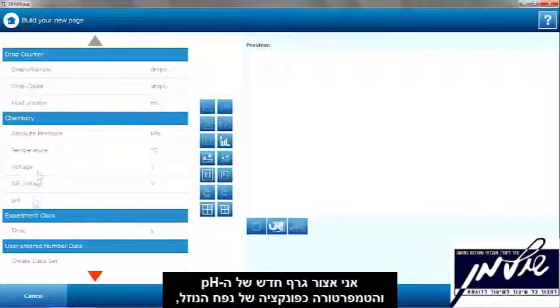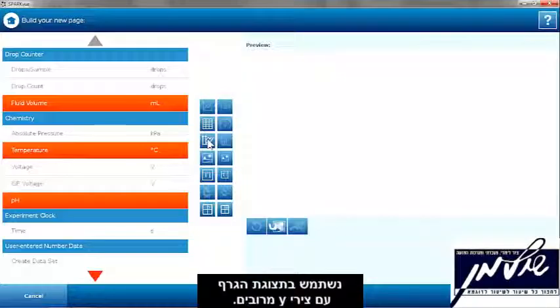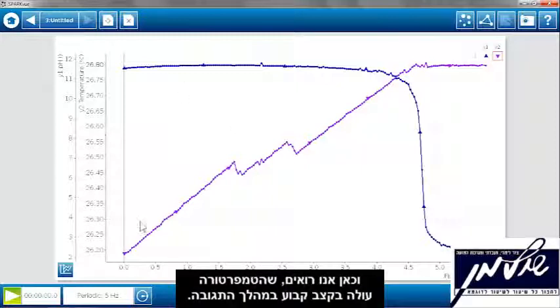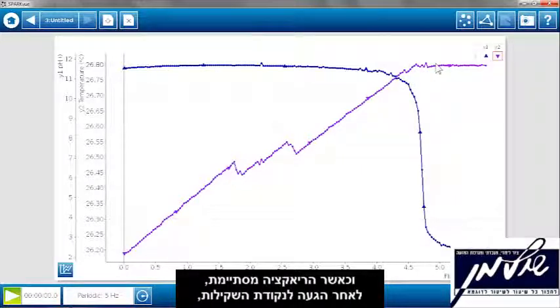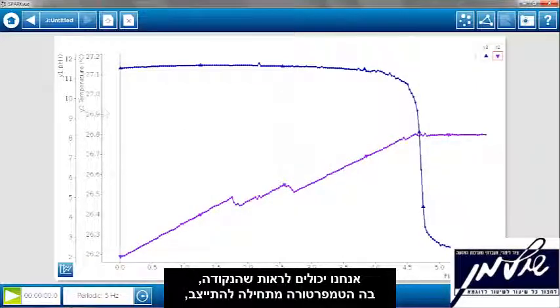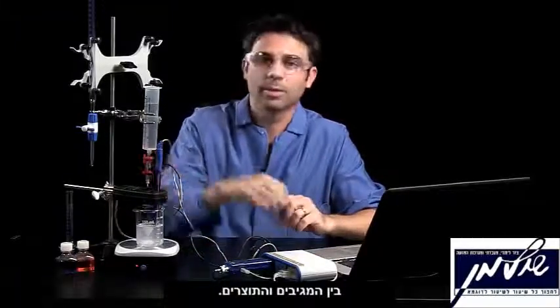I'm going to plot my pH and temperature versus fluid volume using the multiple y-axis feature to see what the data shows. The temperature steadily increased as the reaction happened, and once the reaction stopped at the equivalence point, the temperature leveled off and would eventually cool back down to room temperature. We can see that the point where the temperature started leveling off is approximately the same as the pH equivalence point, giving us a clear picture of what's happening with the reactants and products.